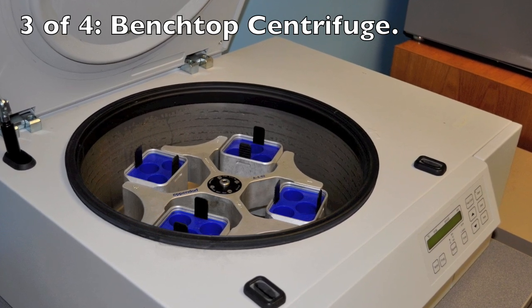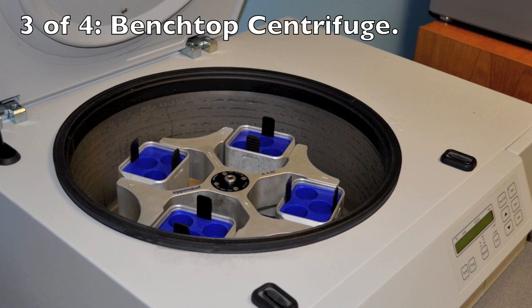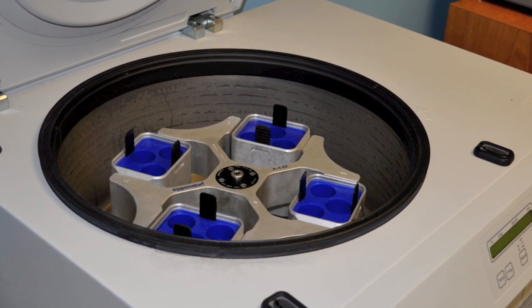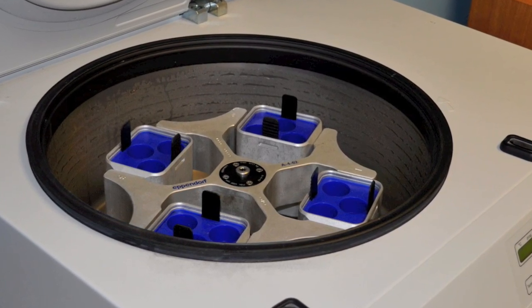This is a large benchtop centrifuge. It has a number of features — for instance, it has replaceable rotors on it. It has a variety of different carriers that can work with tubes as small as 1.5 milliliters all the way up to tubes that are 50 to 100 milliliters.